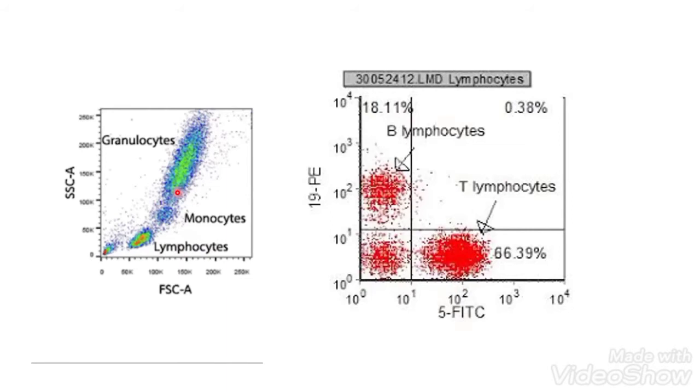neutrophils and other cells. Now what is happening, that everybody has used the Microsoft Paint. There you can use the selection area and you can select anything.